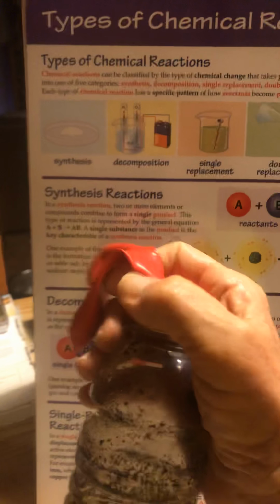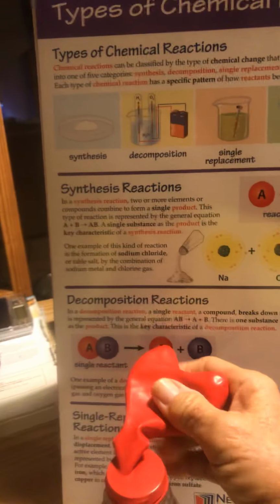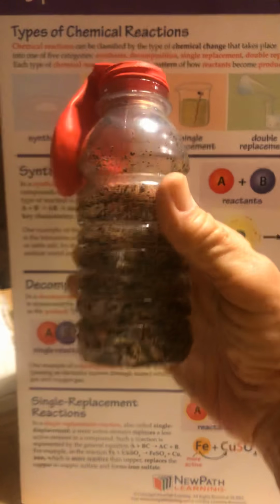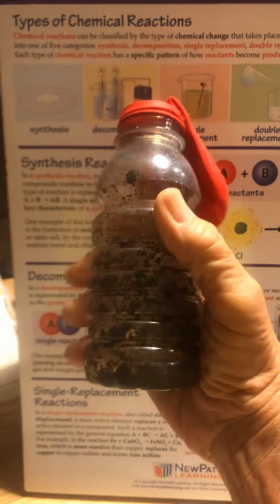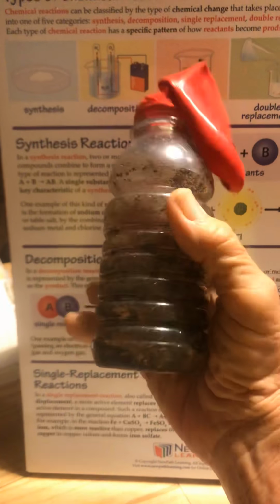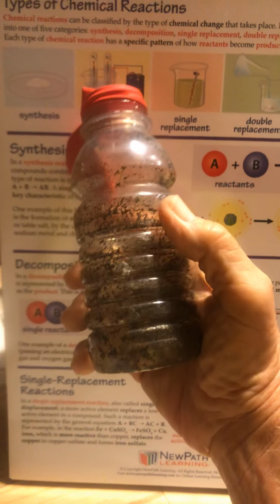So you had iron filings and water, and of course you had oxygen in there, normal atmosphere. And we blew up this balloon just a little bit, not much. And we're going to take a look and just see what happened overnight, whether or not there was any synthesis or combination of these different elements that made up a different compound.